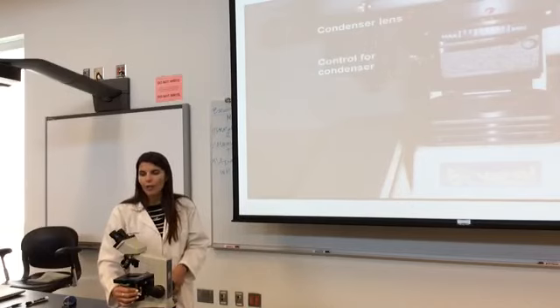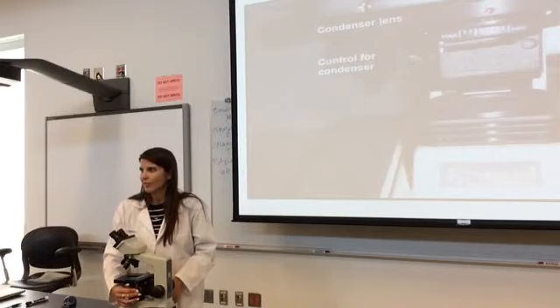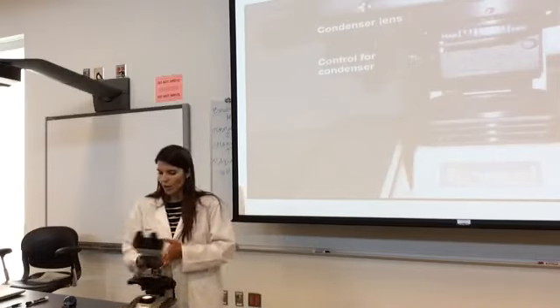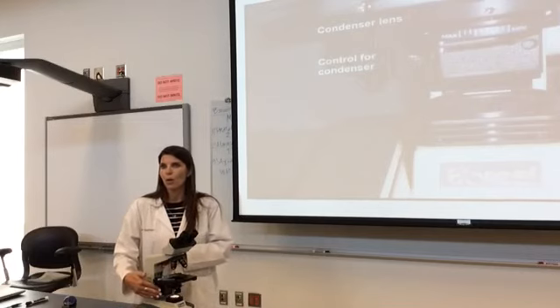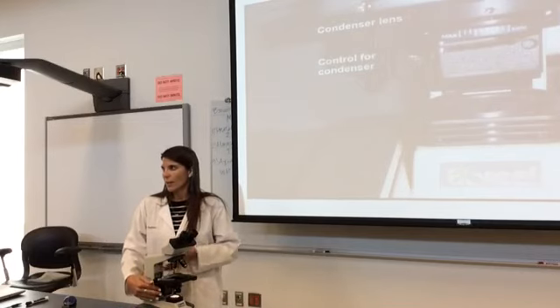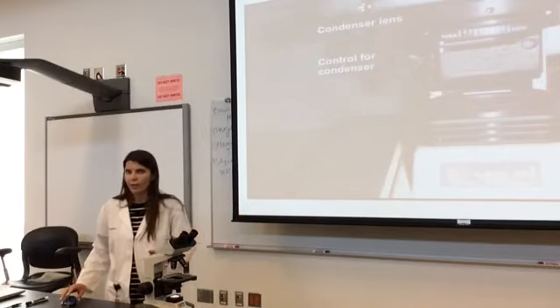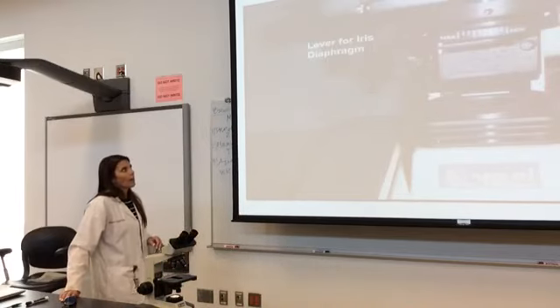These are the stage controls. So you have the controls for the stage on the right side, and you have the condenser control on the left side. Everyone okay so far? Touching it, putting your hands on it? You're good. Okay?